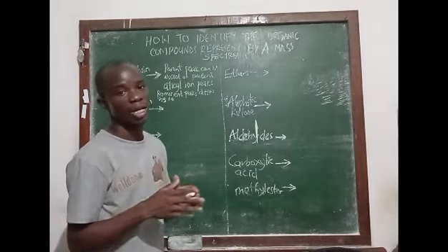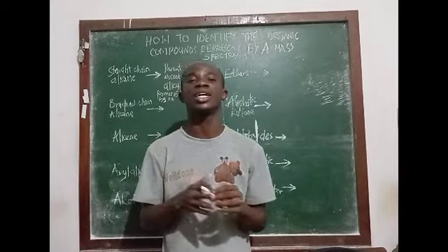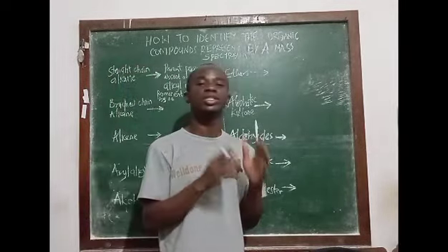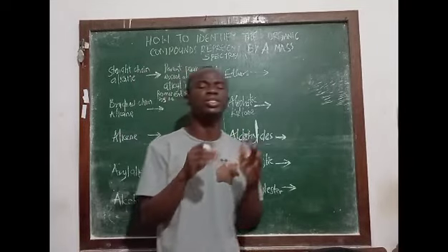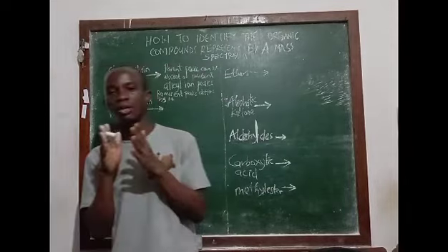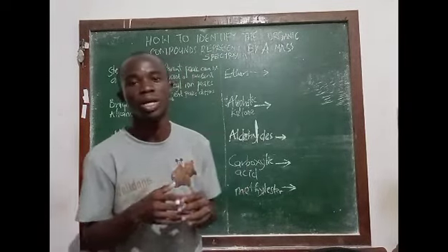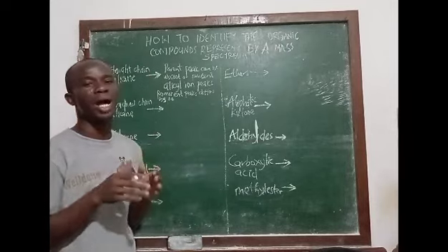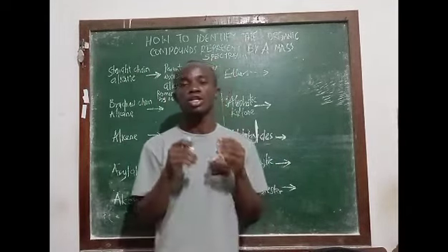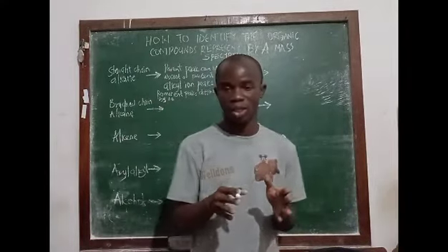For a branch chain alkane, some of the properties mentioned for the straight chain alkane will also be seen for a branch chain. The major difference between the straight chain alkane and a branch chain alkane in terms of their mass spectrum is that in a mass spectrum that represents a branch chain alkane, some of the alkyl ion peaks will be missing.